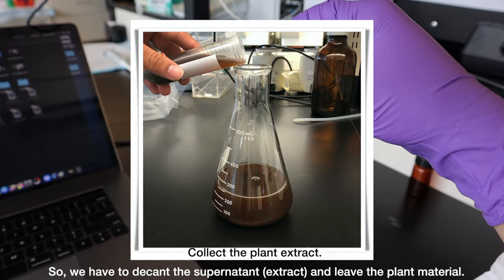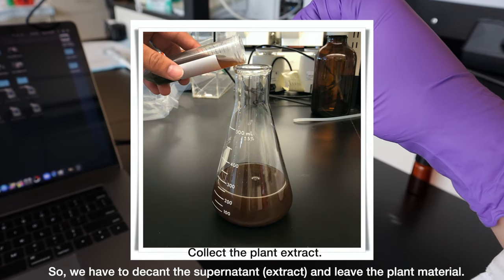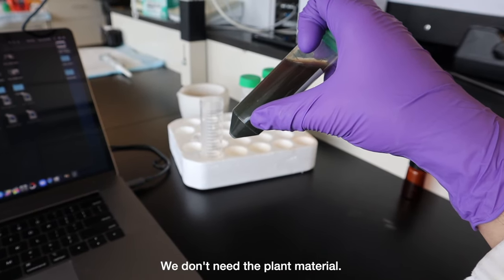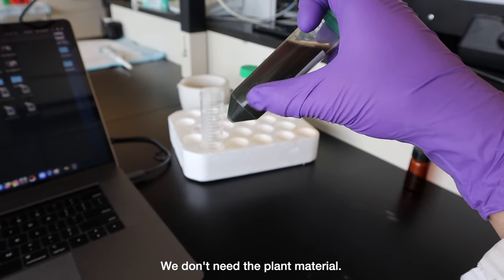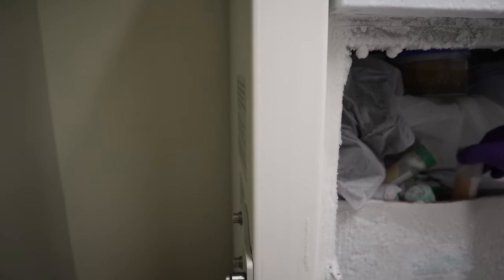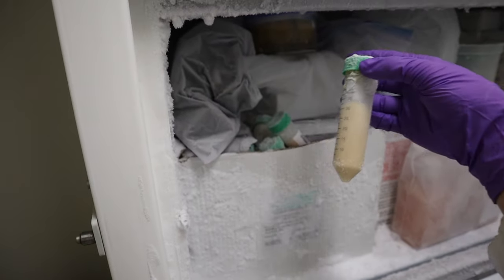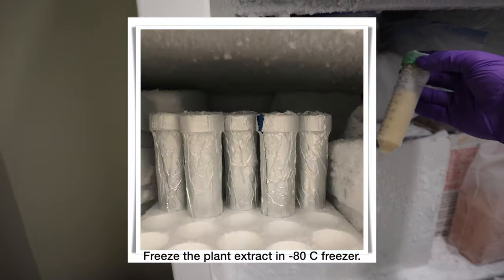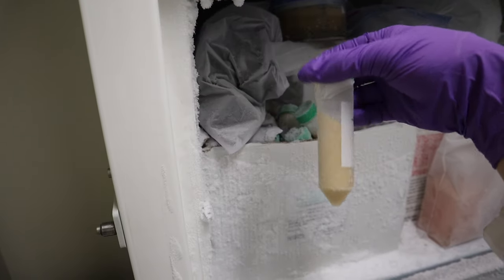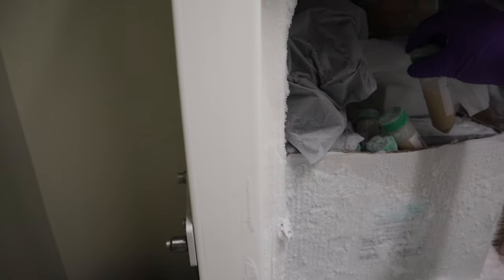We have to separate the supernatant and the plant extract from the plant material, all the leaves, because we don't need this part. After collecting the plant extract or the supernatant after the centrifuge, we put it in a centrifuge tube. Then, put this in the negative 80 degree freezer to freeze the plant extract.